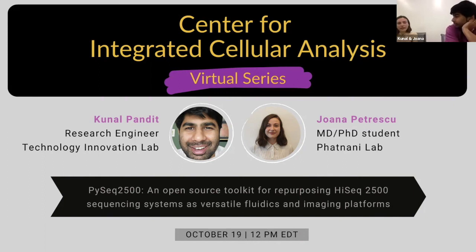Yeah, and I think especially with my tissue sections, like you said, it would be very easy to manually measure the ventral horn because it's visible by eye. If you were to try to select an ROI on the basis of the actual microscopy image, that's something that, as Kunal's saying, we would need some sort of adaptive tool to do. But if it's a feature that you can pick out by eye, I think it's pretty easy to zero in.